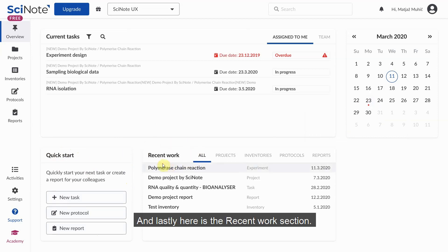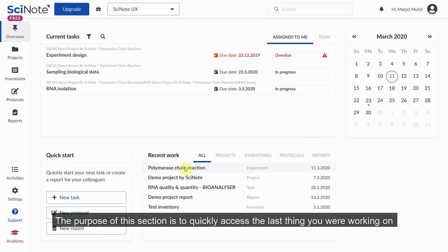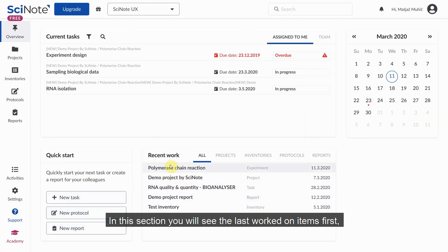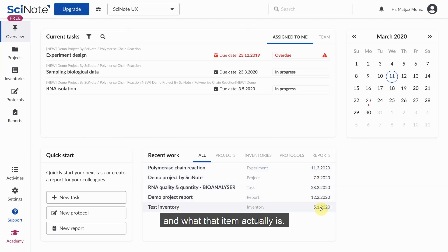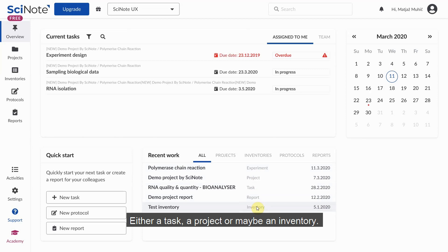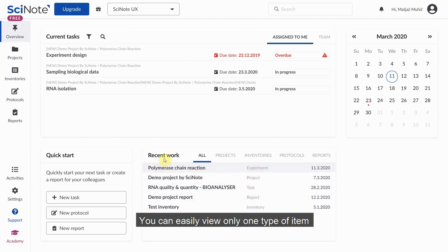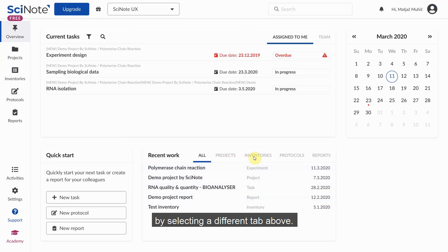And lastly, here's the recent work section. The purpose of this section is to quickly access the last thing you were working on inside SciNote. In this section you will see the last worked on items first, the date that item was changed or created, and what that item actually is — either a task, a project, or maybe an inventory. You can easily view only one type of item by selecting a different tab above.